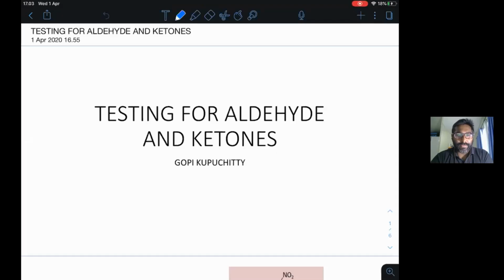Good evening, everyone. Today we will learn about testing for aldehydes and ketones. We have learned about aldehydes and ketones, the carbonyl compounds, which are divided into aldehydes and ketones. They have C double bond O, and then you have R, and this one is H. That's for aldehyde. And if you have ketone, ketone is going to be R, C double bond O, and another R. So take note of that.